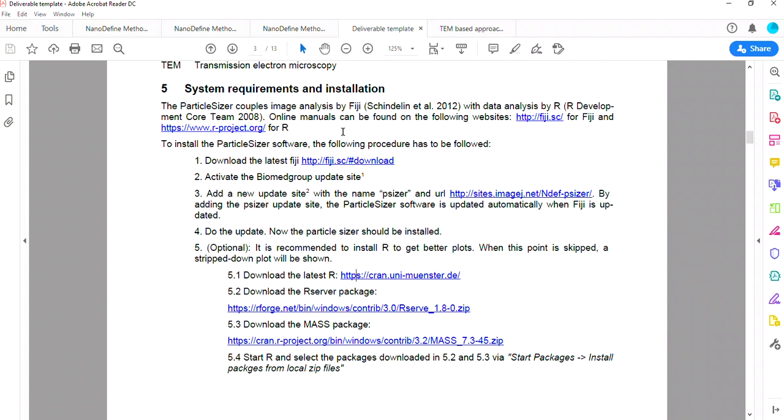First, you should run R always as an admin, especially to install the packages R-Serve and Mass. Make sure your R-Serve and Mass packages are adapted to your version of R. Finally, if you haven't been using R in a while, you might want to download R-Tools and run it to update everything.